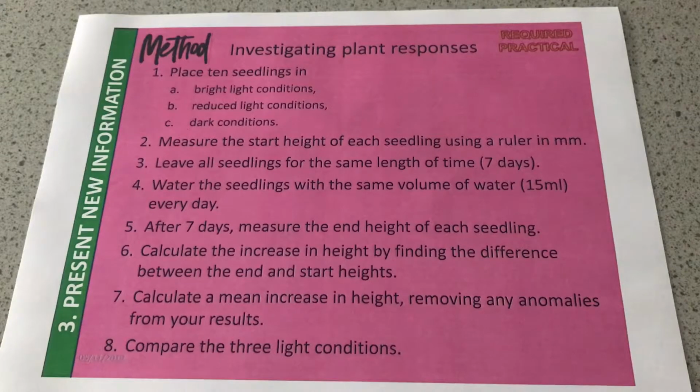We're going to leave all the seedlings for the same length of time. Now, rather than just saying that fixed length of time, we've actually got to give a suggestion. If we said something like 20 minutes, there's not going to be enough growth in that time to actually register a difference. So we're going to make a suggestion, and I've suggested 7 days. So don't be afraid and think, what would the exact answer be? So long as it is kind of in the rough region of being a suitable, realistic amount of time, that will be fine. So if you said maybe 2 days or a few days or whatever, I've gone for 7 days, okay?